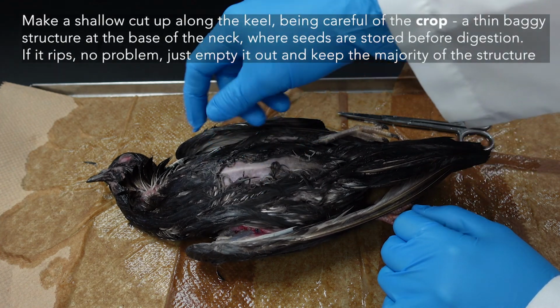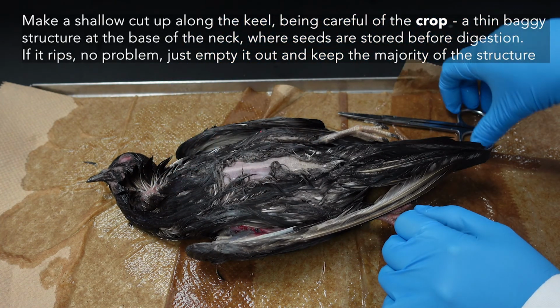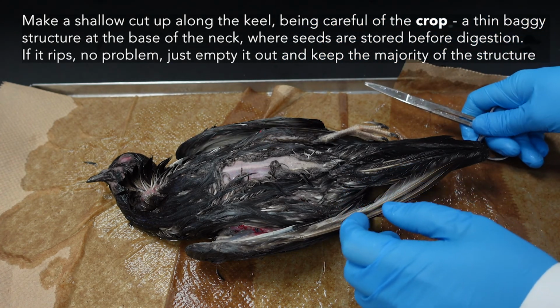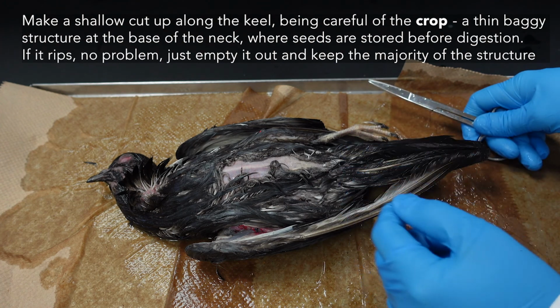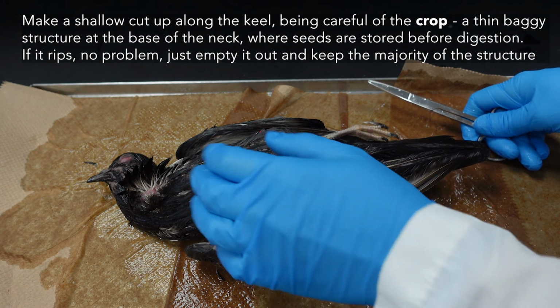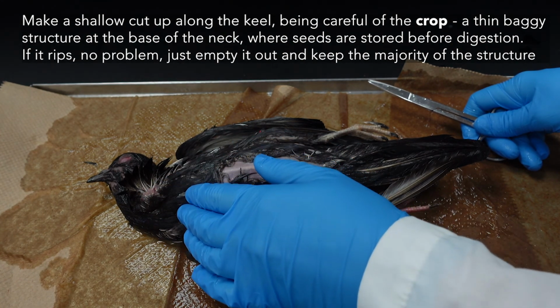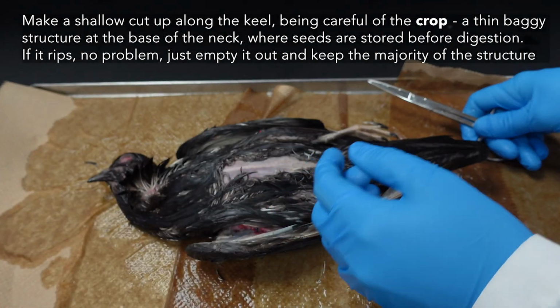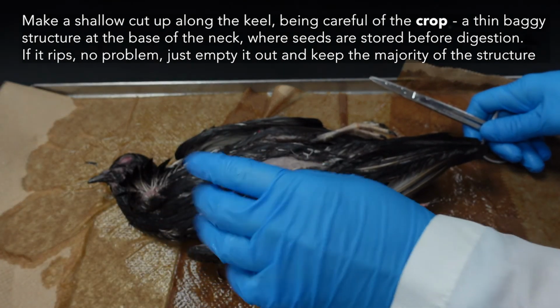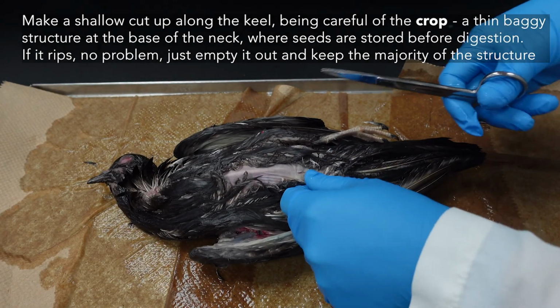Be very careful as you're coming towards the top of the neck, because there's a structure lying very close to the skin called the crop, where birds store seeds and other things that they have eaten. So it's okay if you cut into it, you can just empty it of seeds or whatever the bird's dinner was. But you'll want to keep that structure for the digestive unit. So if you can avoid cutting it, that's great. If you accidentally get into it, that's also perfectly fine. Just make sure you keep the structure.